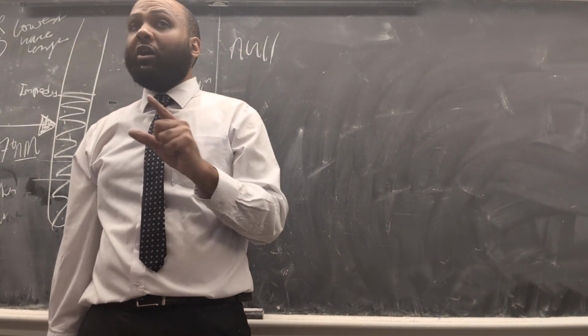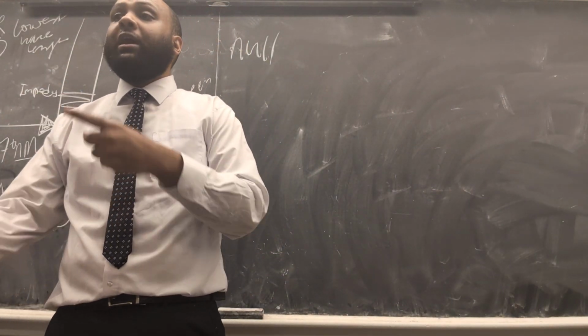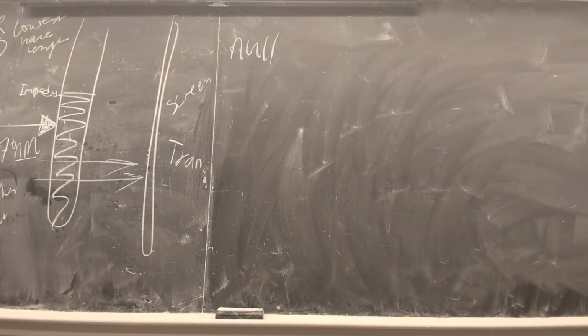So now you have to understand, why are we using a spectrophotometer? How does the spectrophotometer work? And what are we testing? So without wasting time, let us now begin.